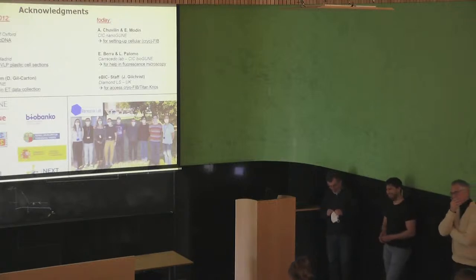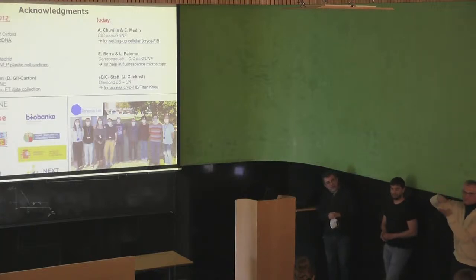Because actually we don't understand anything, we just write whatever you tell us. What I want to say is, we will not study 80% of your samples with cross-section anymore, because the most common thing you are asking is the penetration depth of interdiffusion between two layers. We don't make a section for that. We make the depth profiling with ToF-SIMS. And that's much easier and much faster.